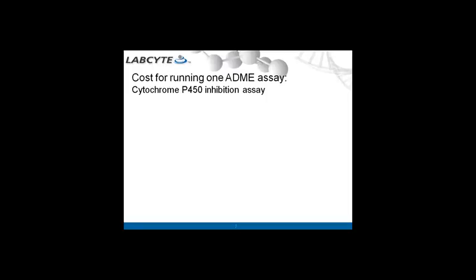Cytochrome P450 enzyme, also known as CYP450 enzyme, is a large and diverse group of enzymes that are involved in drug metabolism. There are many CYP450 isozymes. Seven of them are responsible for metabolizing the majority of xenobiotics. So the inhibition of these enzymes could be the major source of adverse drug interaction. It is extremely important that CYP450 inhibition is evaluated as early as possible.